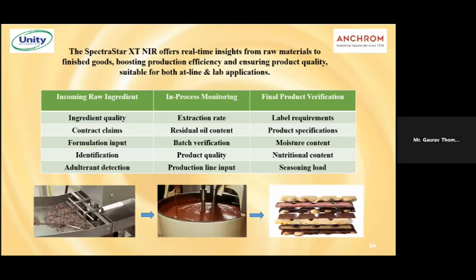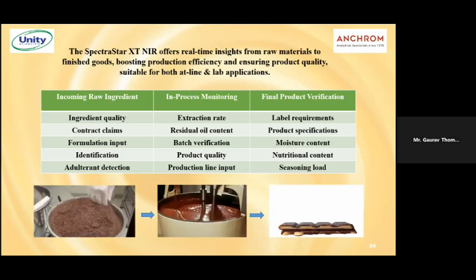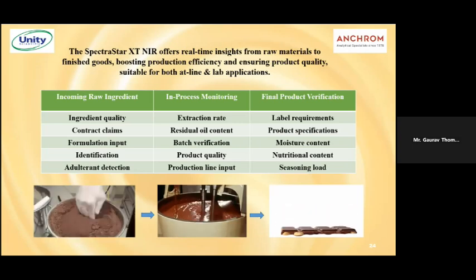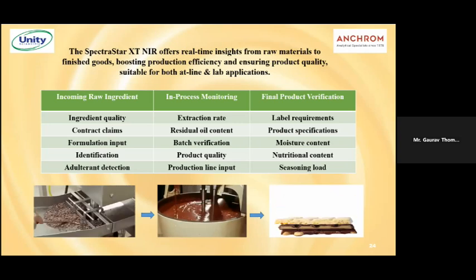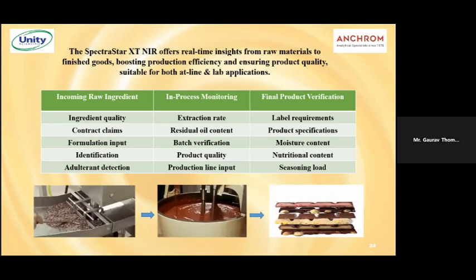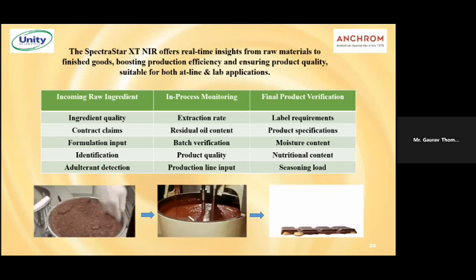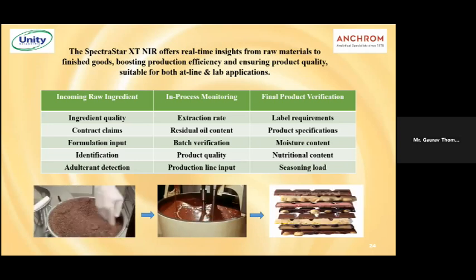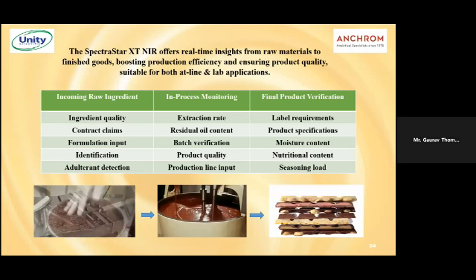Now the cream is separated, and the cream is nothing but the fat content of it. So you could check that initially the fat content in our milk was XYZ, and now, after separating the cream from the whole milk, you have some ABC fat content in it. You could compare the data on the same instrument at the same place.